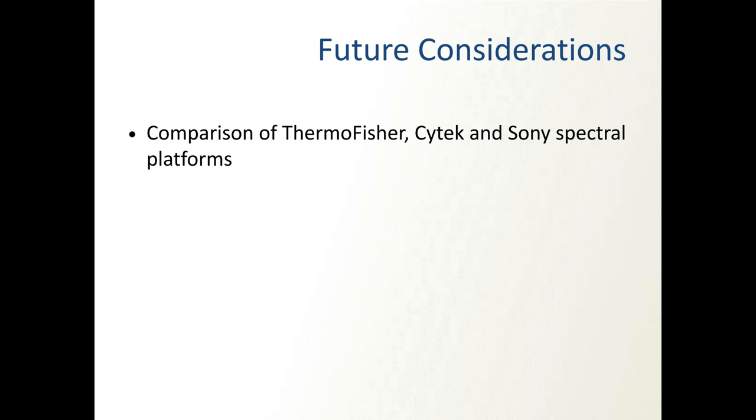And I think this is where the next great drive in flow will be: comparison of these different spectral platforms. Because for a while, it was all defined by Cytek with their Aurora, and that thing delivered amazingly. But now we have the Bigfoot, and now Sony has their new ID system, which is a super high dimensional spectral system.